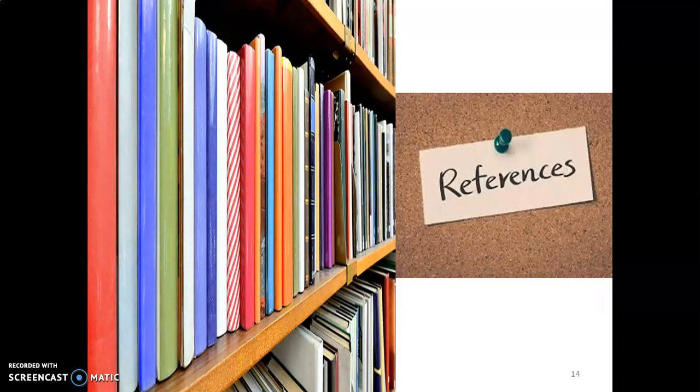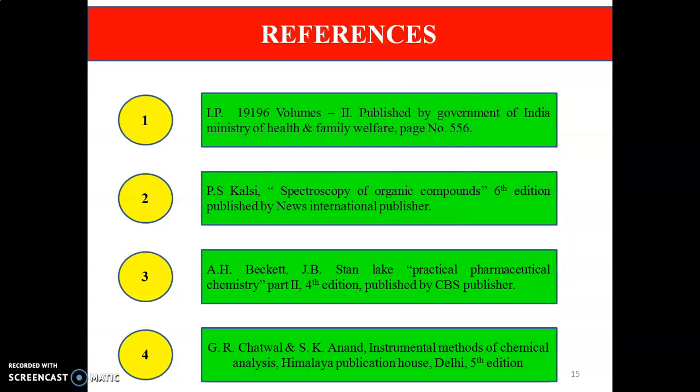And then finally you have to write down the results and the conclusion. So these are the references.